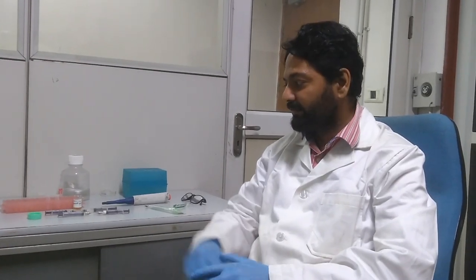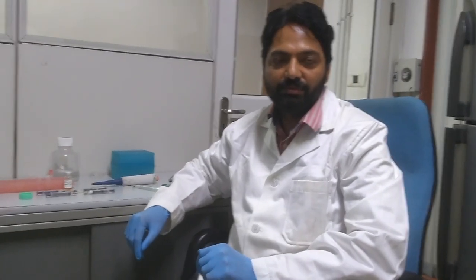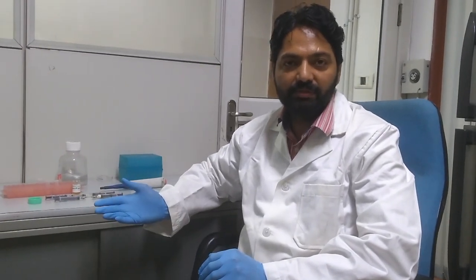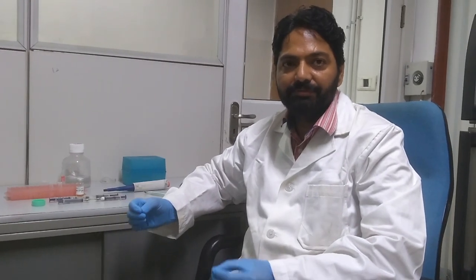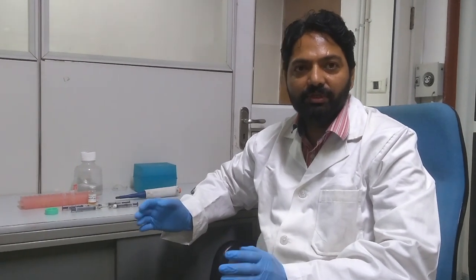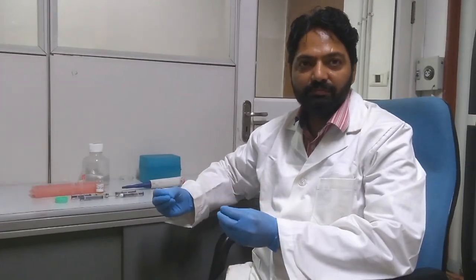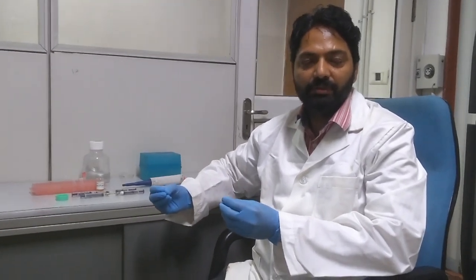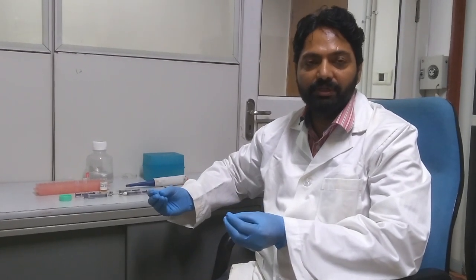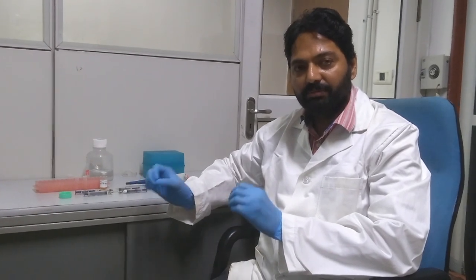Now let us understand why we prepare the emulsion. We have checked that the emulsion is formed. Now, the purpose of making the emulsion: you have antigen, and through antigen you can raise antibodies, but after emulsifying them, you actually make the antigen release slowly. So it is a sustained release kind of preparation, so that the antigen is exposed to the system in a systematic manner, so that more and more memory cells can be generated. And that's the sole purpose of having the emulsion.